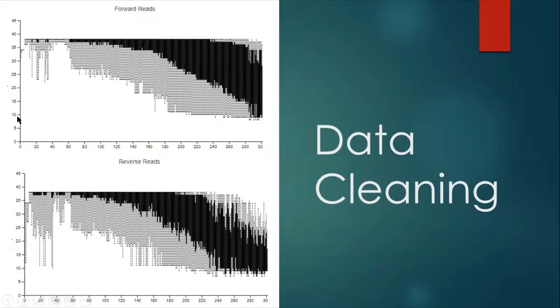The y-axis here is what is known as the Phred score, spelled with a PH, not an F. And what it means is, from 10 and above, everything is 90% good quality, which is a fairly high score for most people. However, since we're biologists, we don't just want 90%. So if we look at 20 and above, there we're dealing with 99%, 30, 99.9%, and so on.